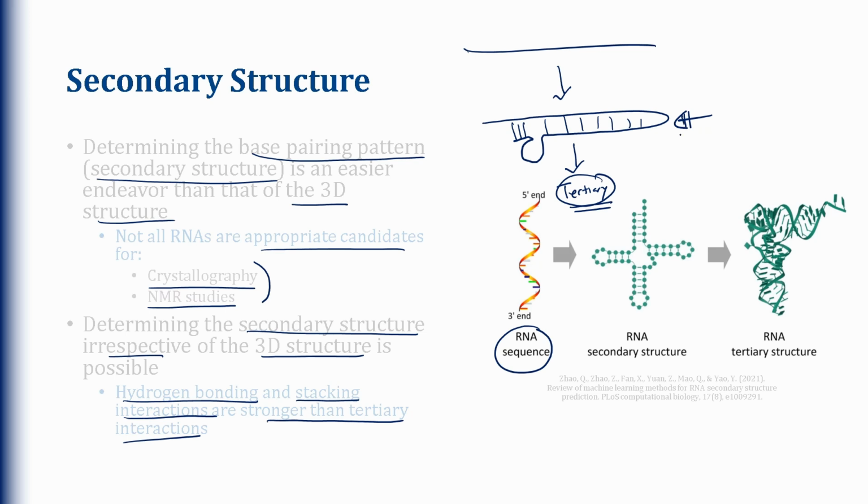And the way we do this is we combine information from energetics. So we use the sequence and we use nearest neighbor thermodynamics along with algorithms like dynamic programming to deduce the secondary RNA structure, and we combine this with information that we obtained from SHAPE. Remember, with SHAPE, certain local environmental conditions make a particular nucleotide flexible, and it can react with a SHAPE electrophile.